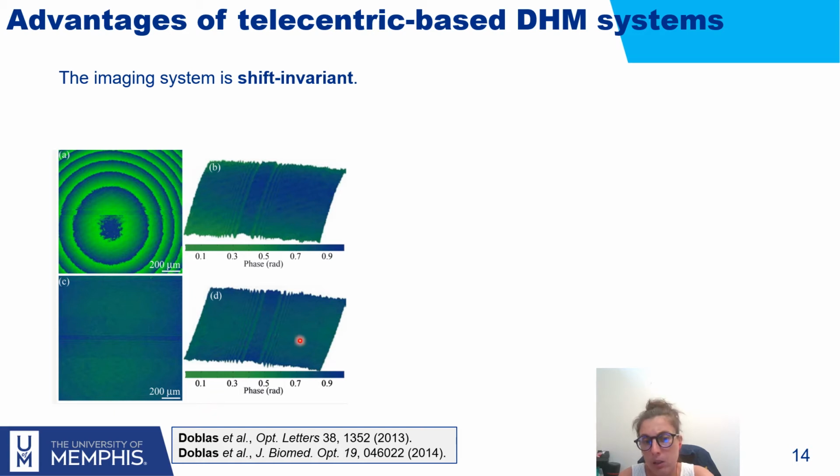So both of them look quite similar, quantitatively roughly the same. But if you look at the edges, you're going to see a kind of shell structure. So it's close enough, but the background should be completely flat, right? And that's what you are seeing in the image. The background of the sample is flat within the experimental errors.